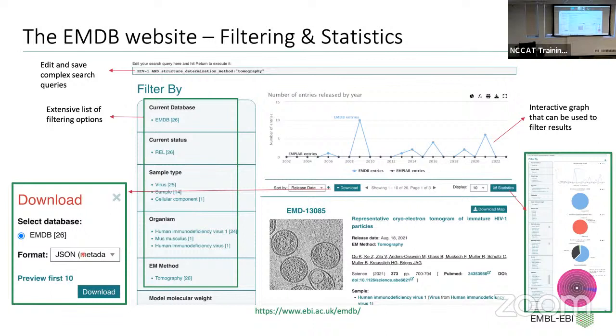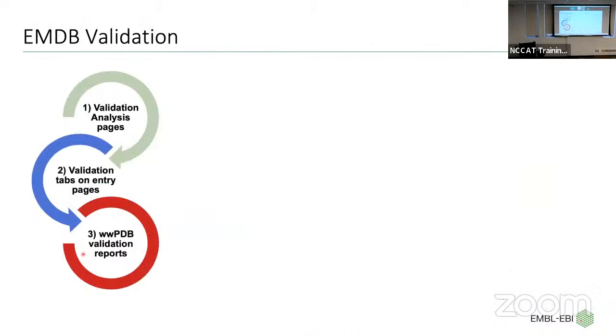So that really runs through what I wanted to show you about the EMDB website. It was maybe that statistics builder that I wanted to show you, so you guys can go away and have a go at that at some point and potentially make some interesting graphs that you can use in your presentations. I now want to touch on EMDB validation.